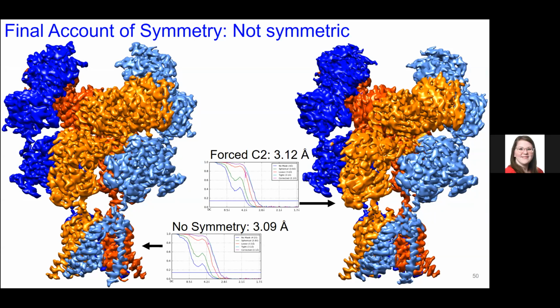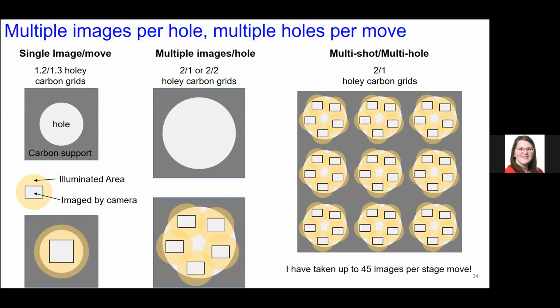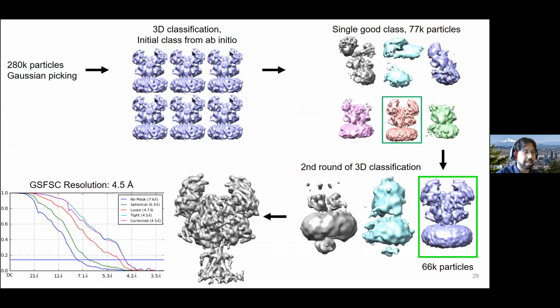Another question was, would you recommend skipping 2D classification for small soluble protein samples less than 200 kD? I can't think it would hurt. So I would definitely try it and see what you see. You could play around with the parameters a little bit, the number of classes you give, the binning, as well as the box size. But I would give it a try. I can't imagine it hurting. If 2D classification works, then 3D classification theoretically should work too.